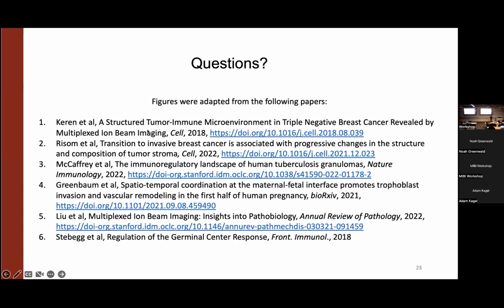For creating the null distribution, what if you don't know what the typical distribution of your cells is? For example, CD20 in lymph node is very well established, but what if you're looking at a tumor where you don't even know what your baseline assumption would be? Well, I think it can be approximated if you keep, for instance, the permutation inside the context of the tumor, because you would expect it to be different from the non-tumor tissue, and try to do the permutations.